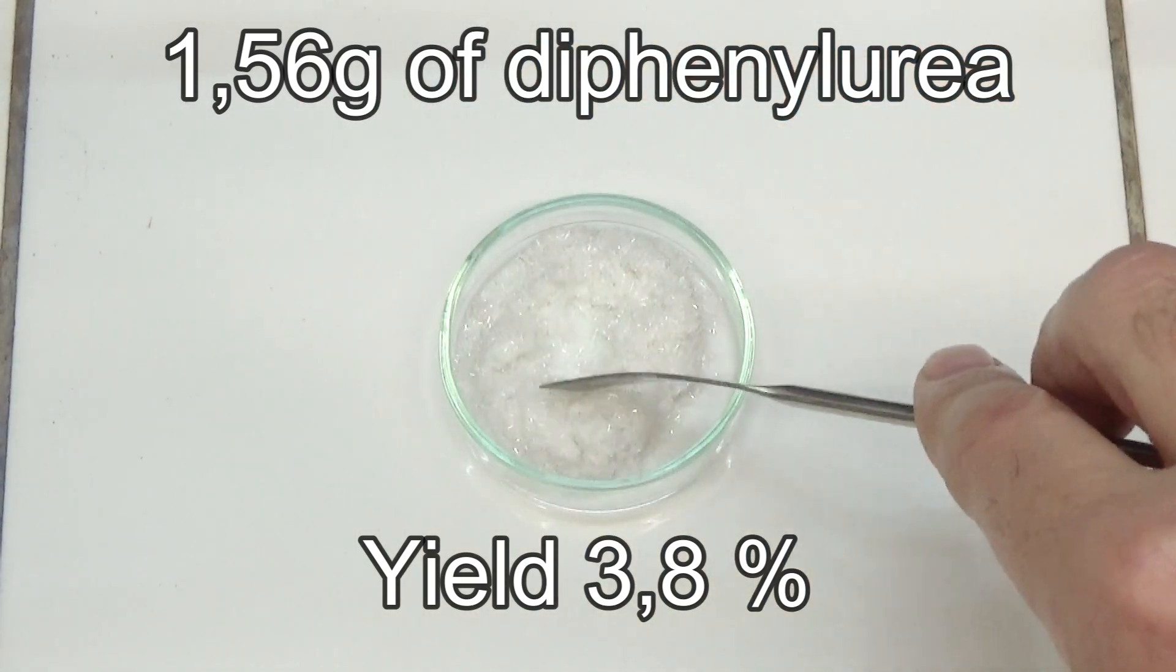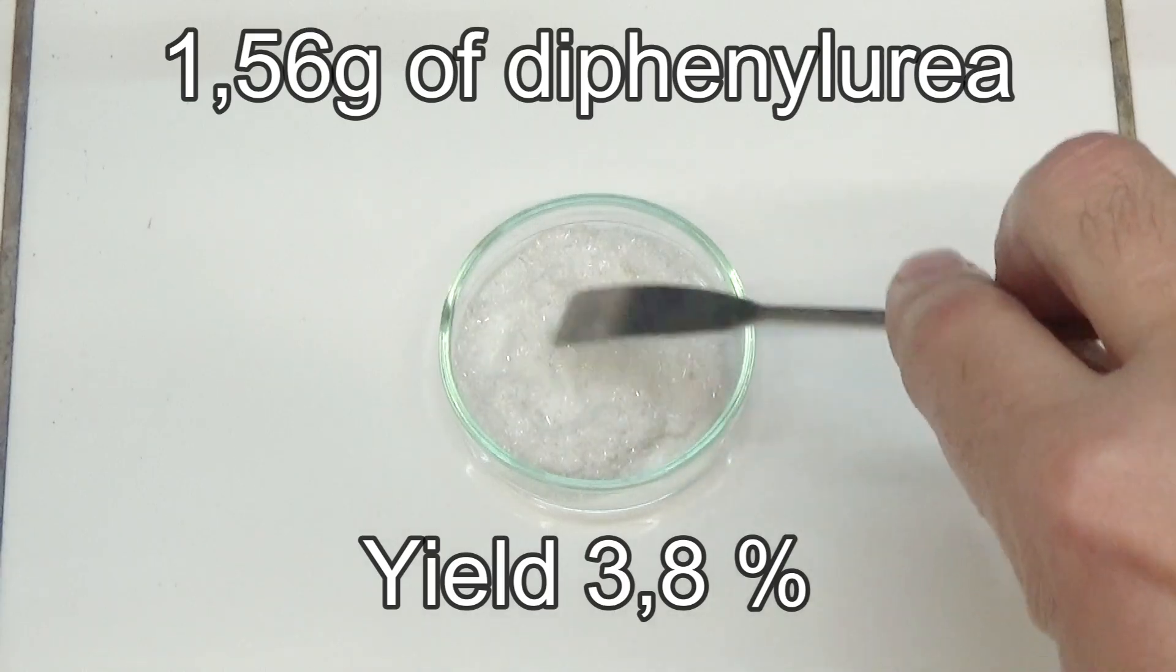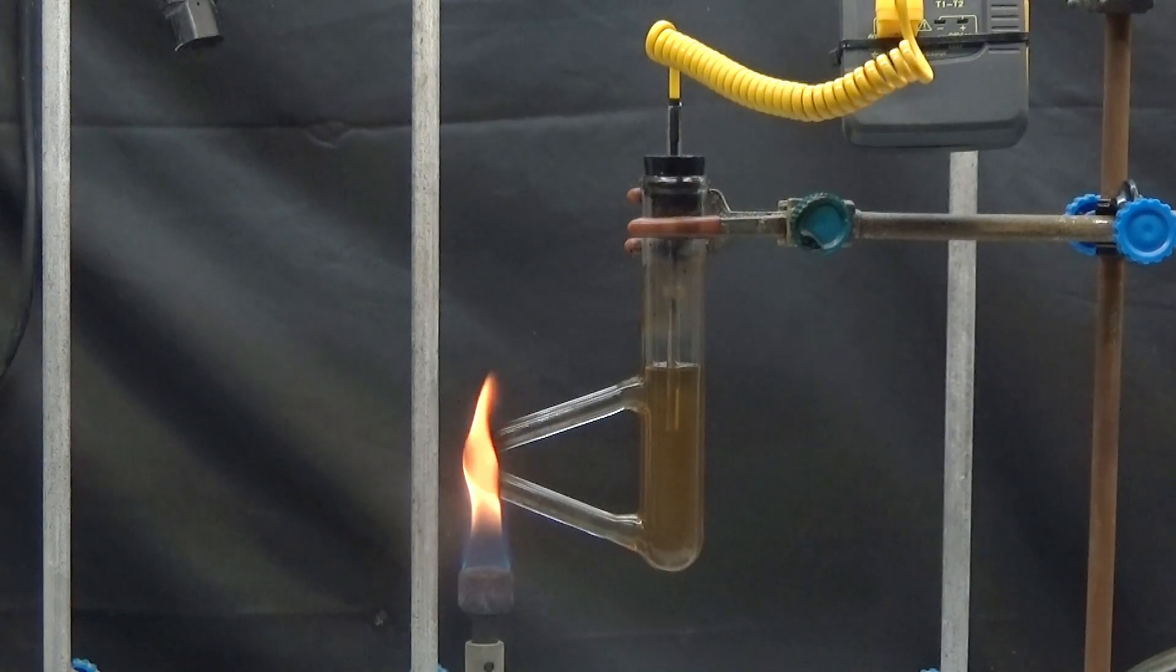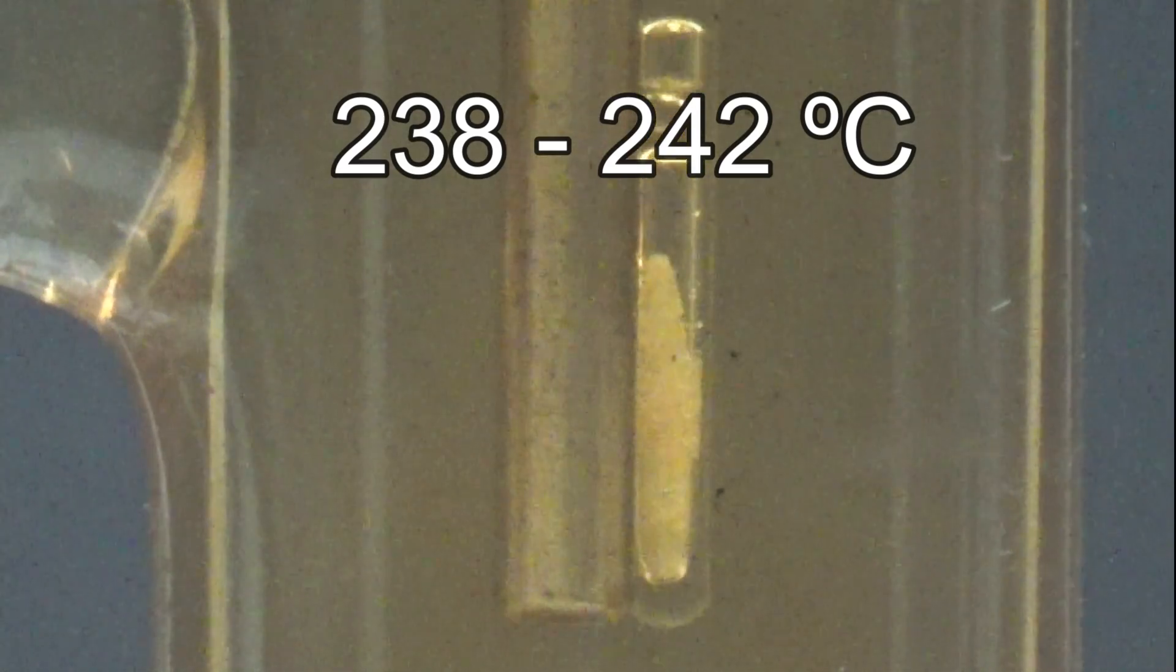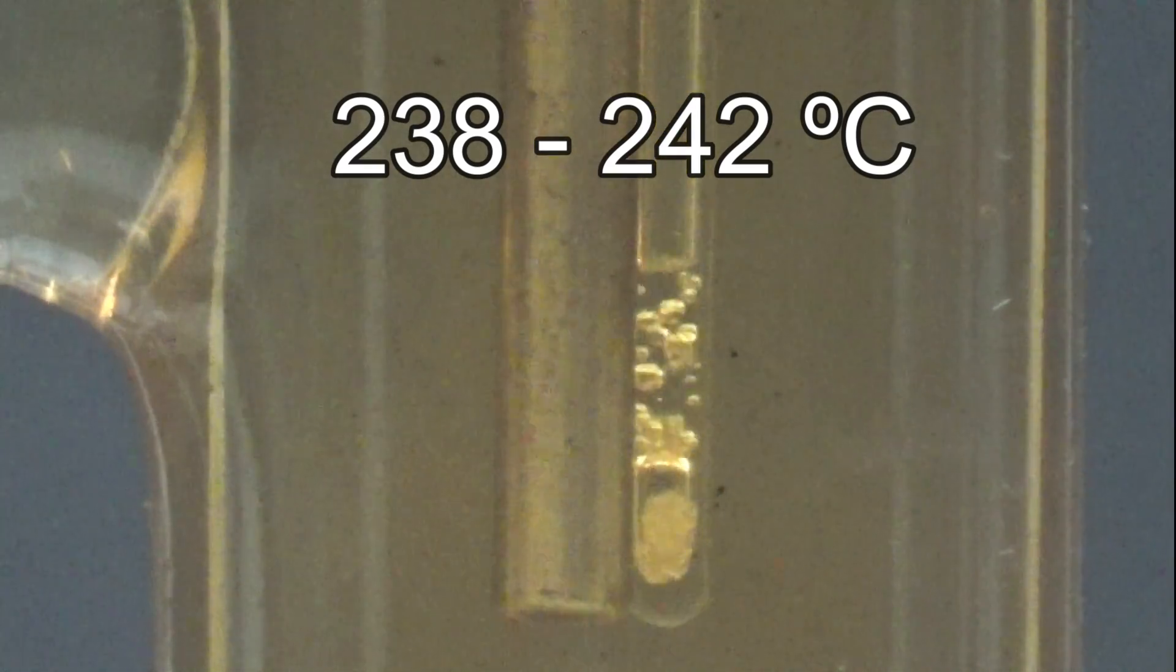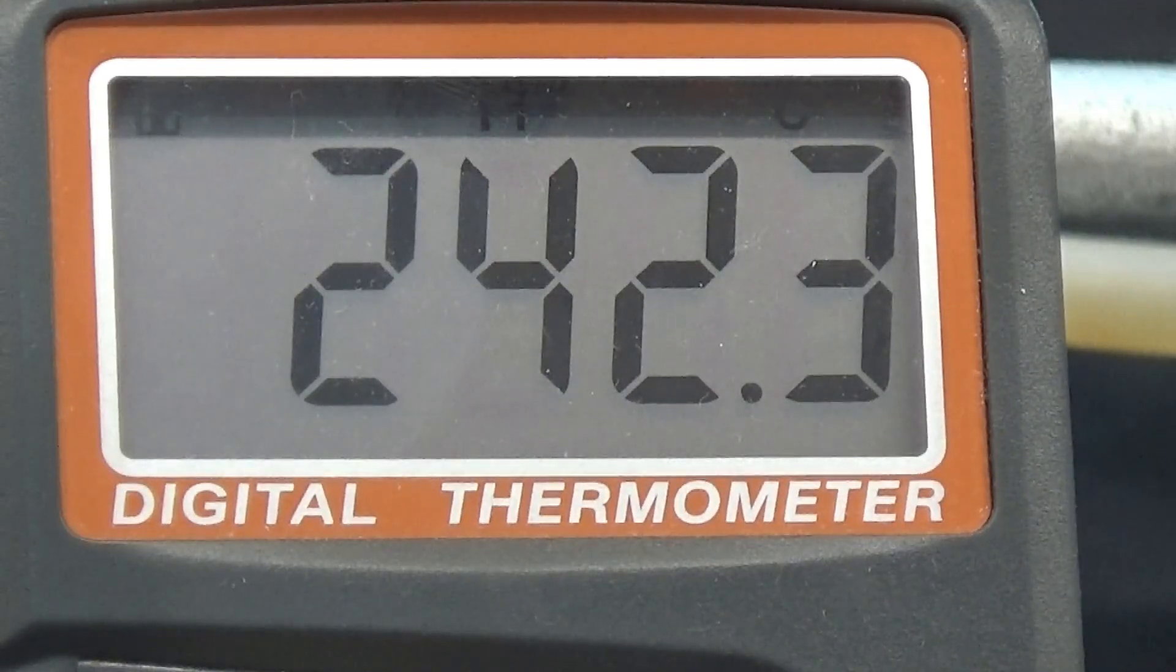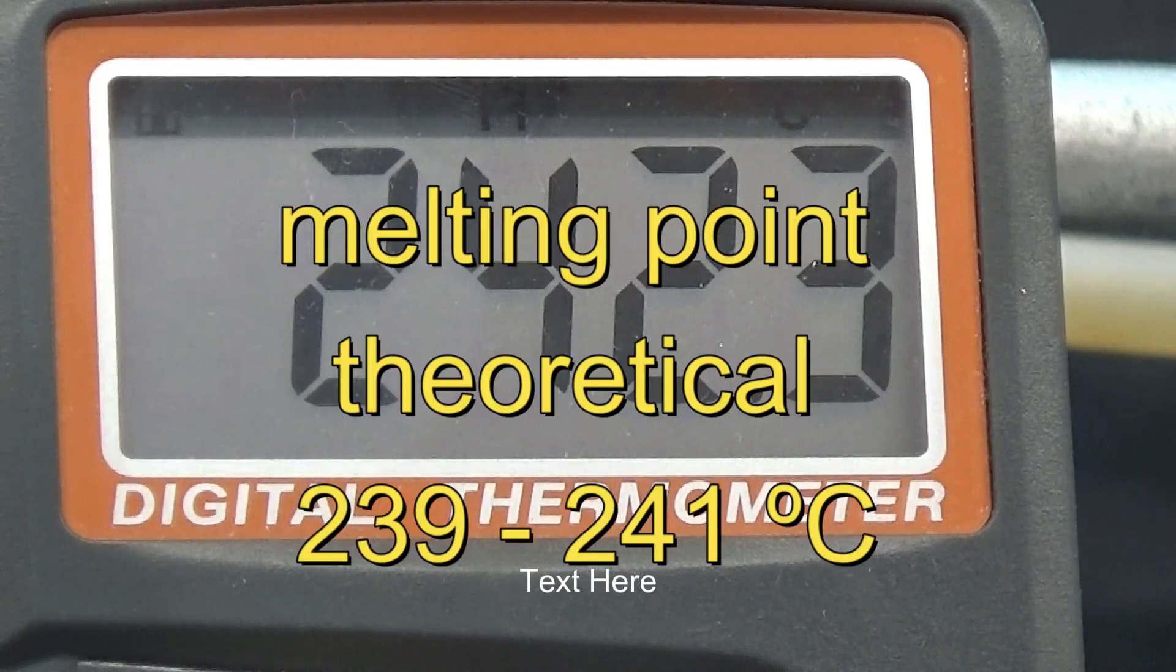The yield was 3.8% depending on the aniline used. First, we determine purity using the melting point. The temperature measured between 238 and 242 degrees. The melting point of diphenylurea is between 239 and 241 degrees.